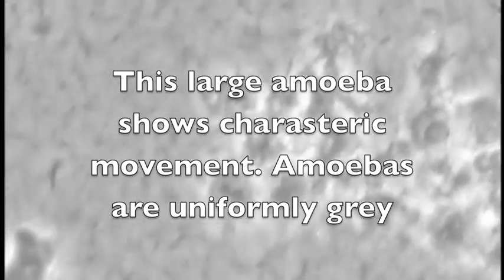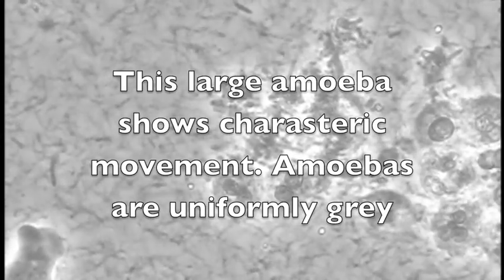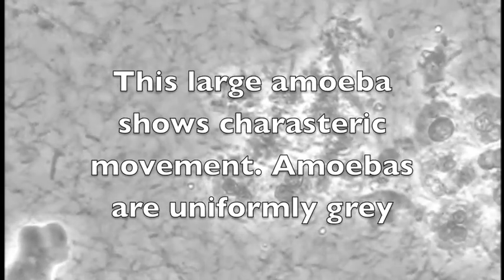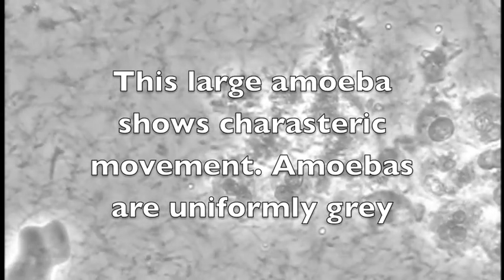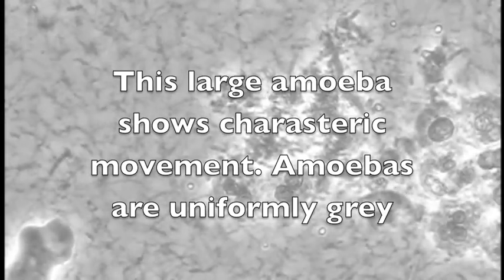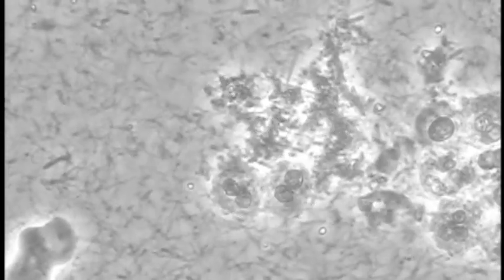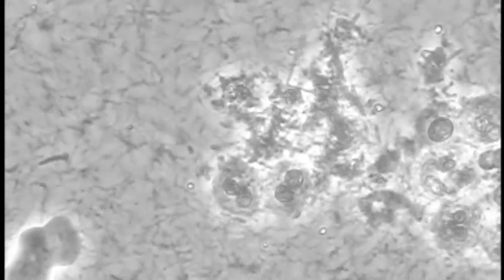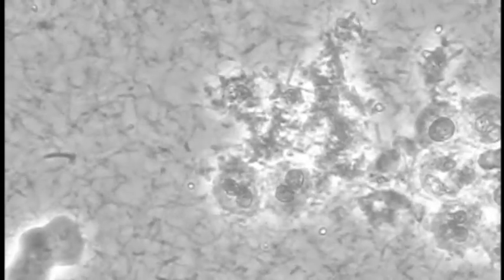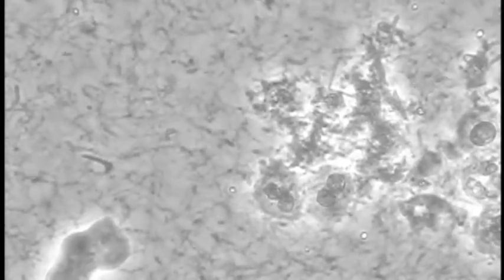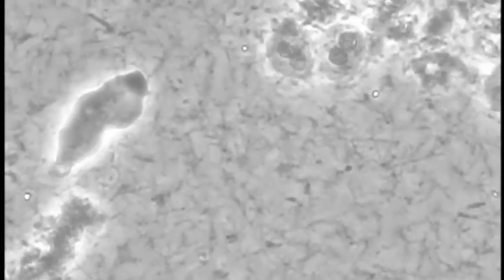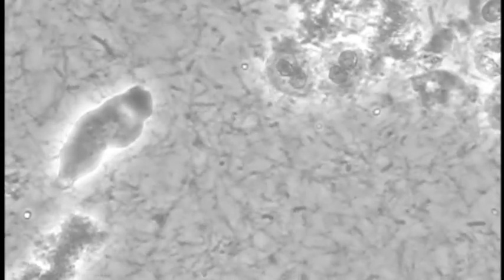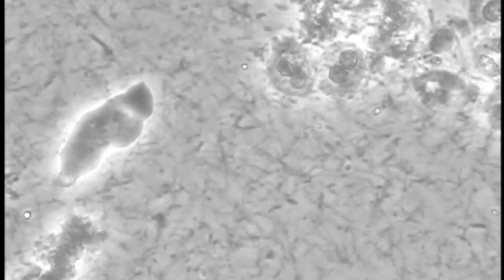You see a large amoeba coming up through the bottom of the slide from the lower left. It's a uniformly gray blob that moves by pseudopodia—pseudopods, false feet they're called. He'll be crawling up into the field here. I'm going to readjust this scene. I moved him up a little bit for you, and you can see him just sliding around doing the things amoebas do.